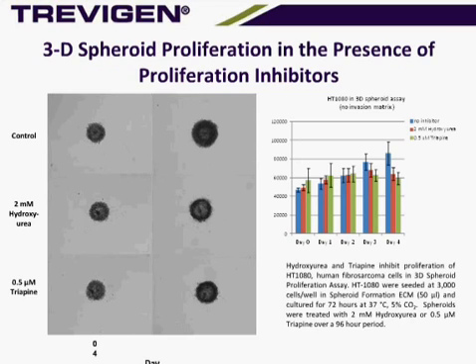You see, I apologize, the bottom of the figures got messed up when we uploaded them, but it's day 0 on the left and day 4 on the right. And we see virtually no growth over the 4-day period with these inhibitory compounds.